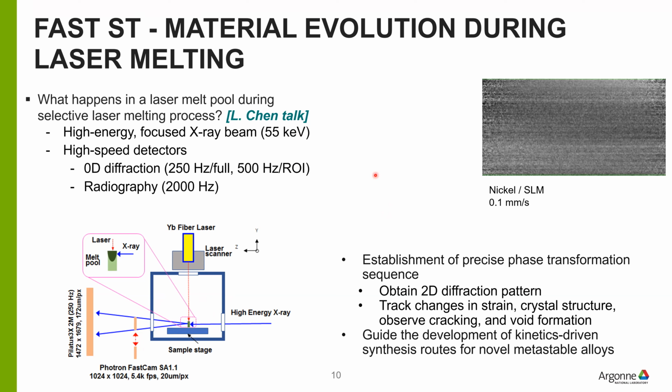Okay, so unfortunately the video is not available here, but we can wait for perhaps Dr. Chen's talk later today, and he might have some beautiful videos of how this phenomenon happens and how we use high energy X-rays to characterize these types of systems, going from an amorphous state when it's liquid to solidification, what that phase diagram looks like and how it's different depending on the rate and the power that's input into the powder bed.